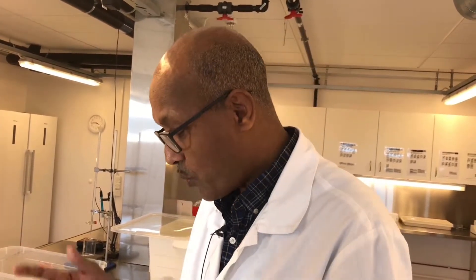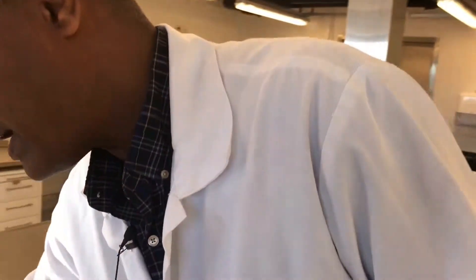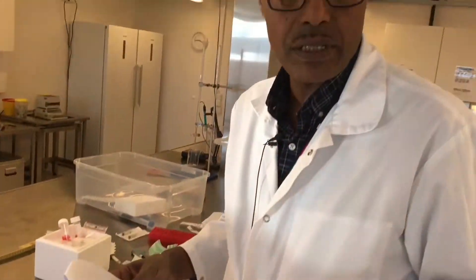We have observed the external body and the internal organs, and we have to register all pathological lesions observed. It can be discoloration, any lesions, hemorrhage, swelling, and so on. This is very important. You can use a blank paper to write down your observations, or simply use a form prepared in advance.